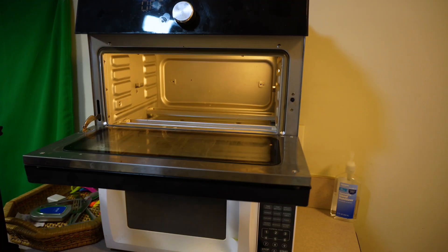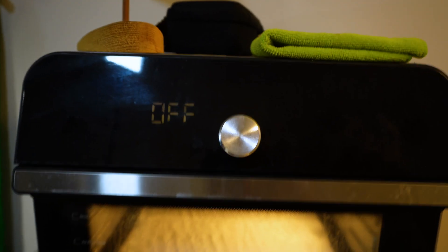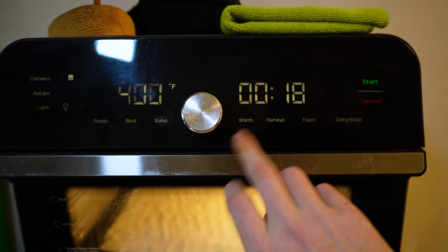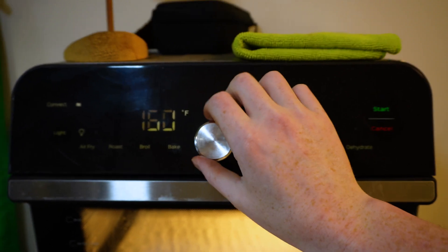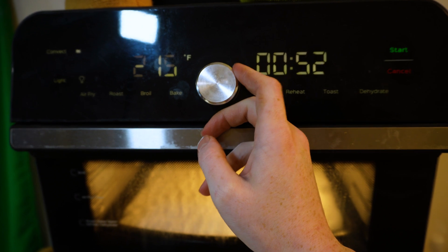You'll want to throw this in the oven at about 100 degrees. Please excuse my oven as it's in AR15 units instead of Celsius. Set the timer for about an hour.